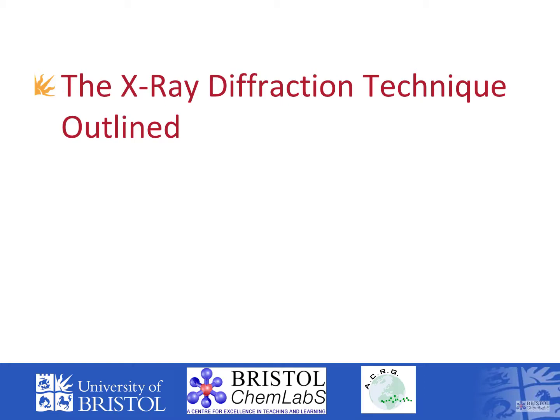I'm Dr Natalie Pridmore. I'm one of our crystallographers here in our crystallography lab. So this is our crystallography lab where we use X-ray diffraction to analyse the structures of molecules and materials.